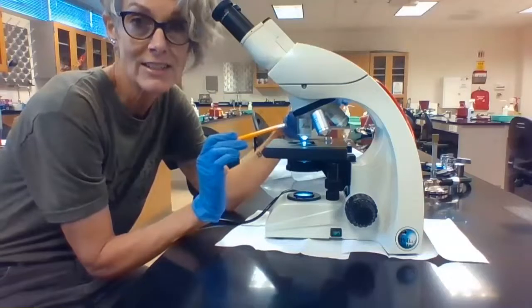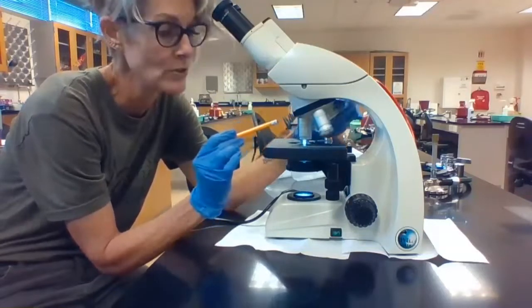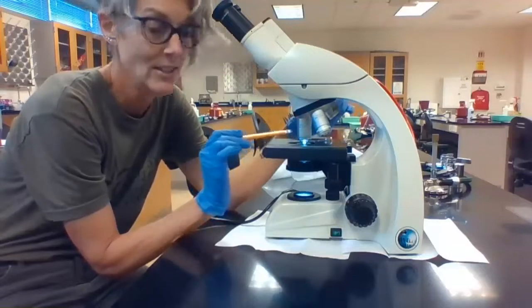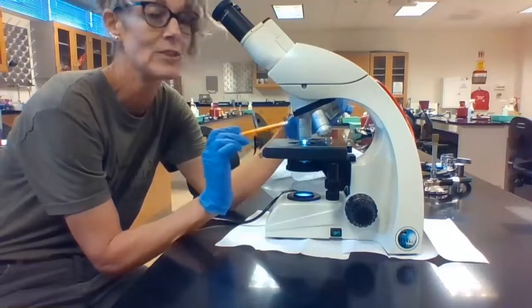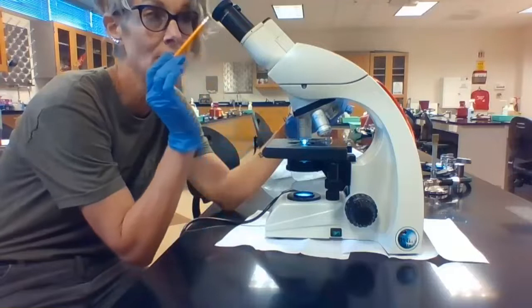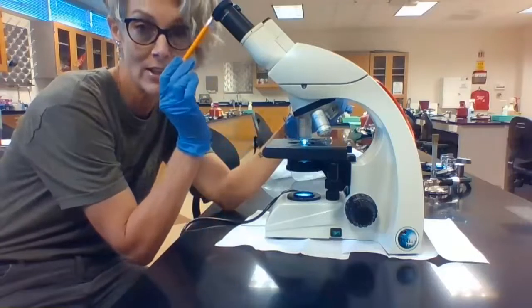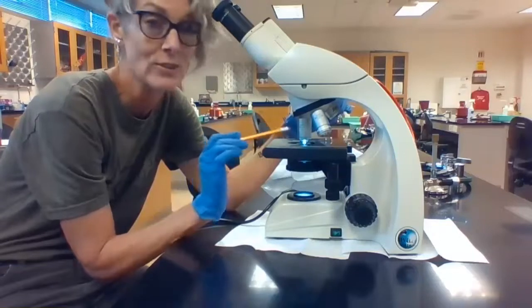The next lens is called the high power objective lens. You just rotate your revolving nosepiece. It has a blue line on it. All the lenses tell you the magnification, and this one says 40x. So 40x from the high power objective lens plus 10x from the ocular gives us 400x magnification when using this lens.